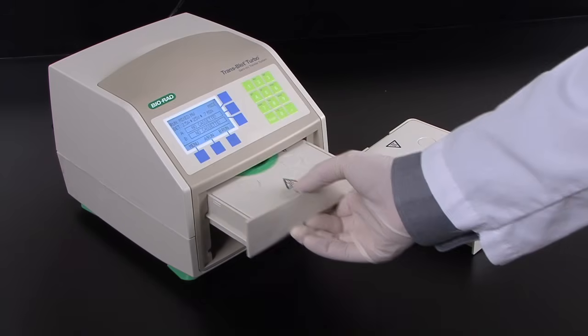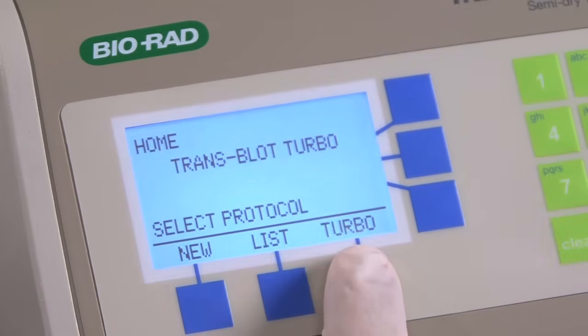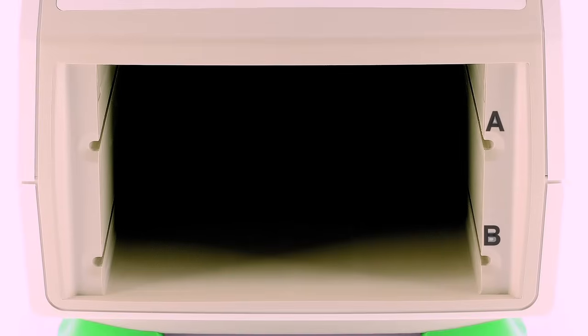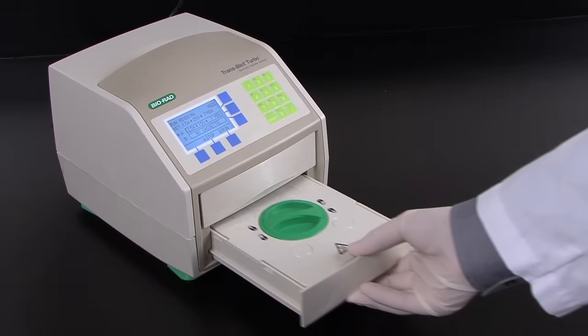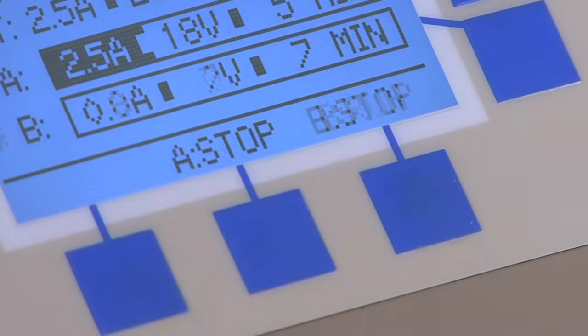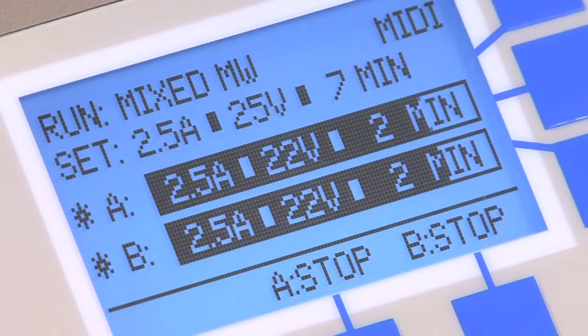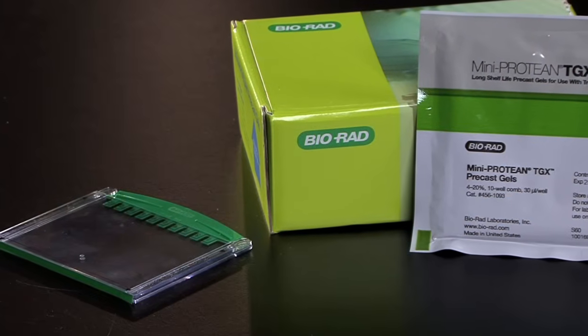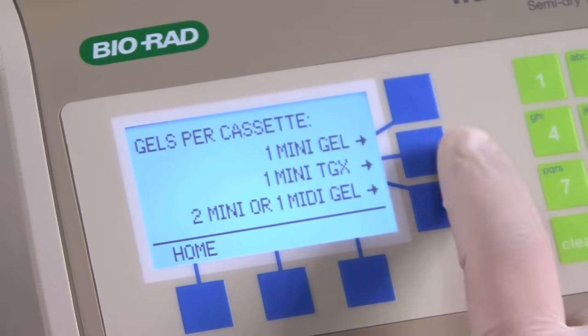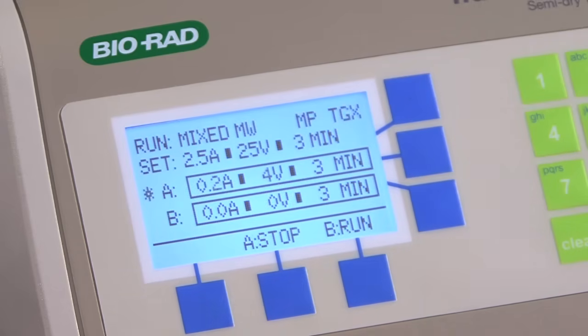Once the cassette has been inserted into the instrument, you can quickly access the turbo protocols for a 7-minute rapid transfer. The top and bottom bays, called A and B, are independently controlled. So you can set up and start one transfer, then start the other bay whenever you are ready. In the run screen, a countdown timer as well as real-time voltage and amperage conditions are displayed. If you are using Biorad Mini Protein TGX gels, you can use the TGX Turbo protocol that provides efficient transfer of one mini TGX gel per cassette in 3 minutes.